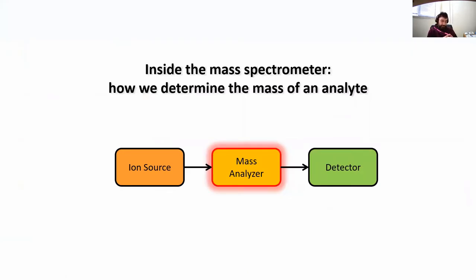Right. So ion sources, we discussed it, right? The job of the ion source is to convert your sample from a liquid or solid phase into gas phase and charge it, so now it can be detected by the mass analyzer. And the mass analyzer actually characterizes a specific mass spectrometer, because there are different types. And these different types usually give the name to the actual instrument.